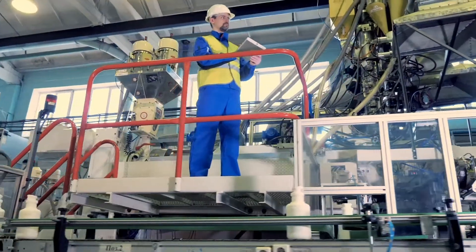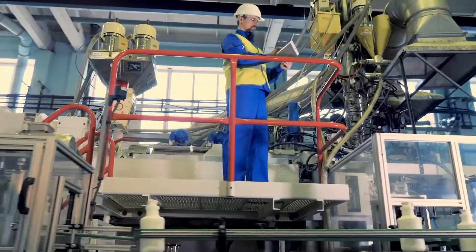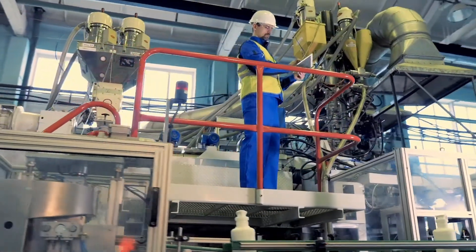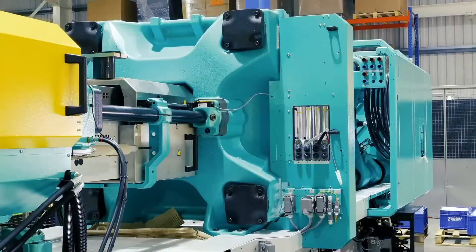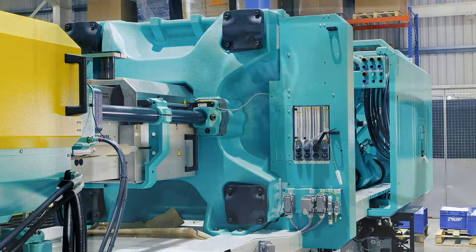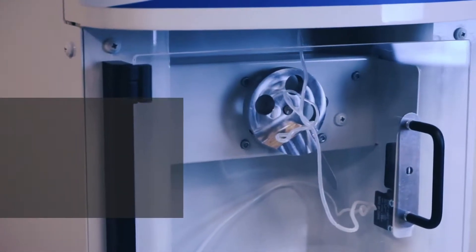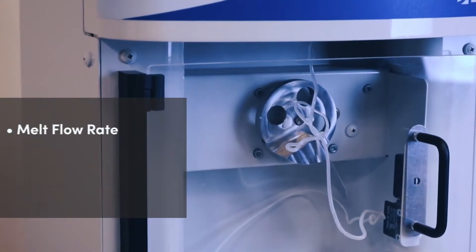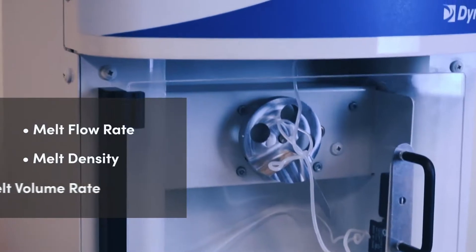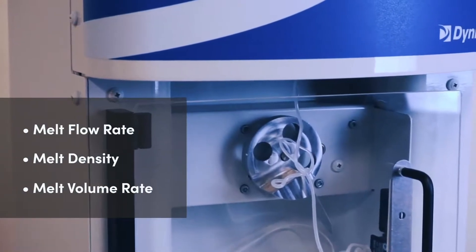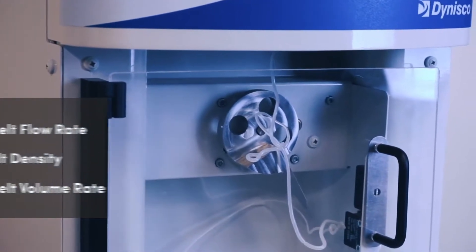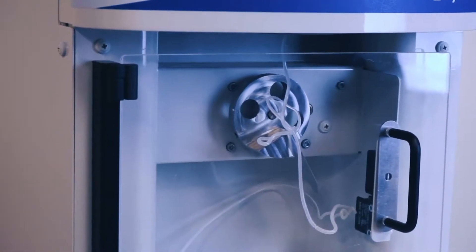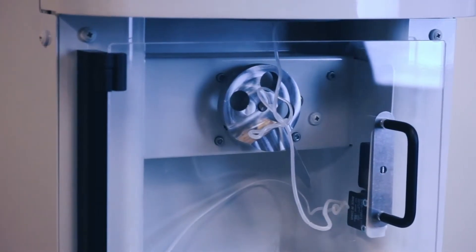This test is used to determine the characteristics of polymers that are used in extrusion and injection molding applications. This device provides values on the melt flow rate, melt density, and melt volume rate of polymers to ensure ideal efficiency conditions without sacrificing product quality.